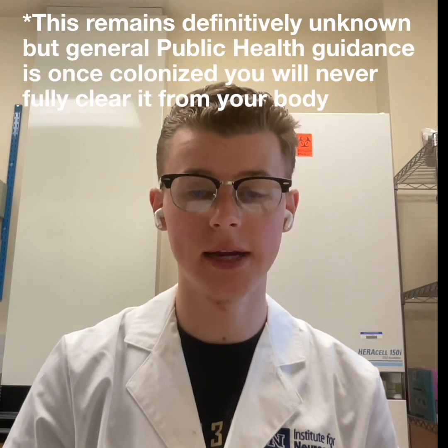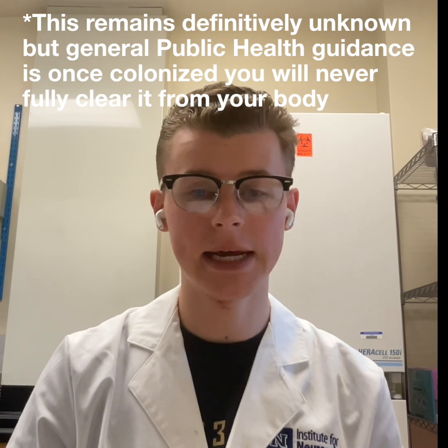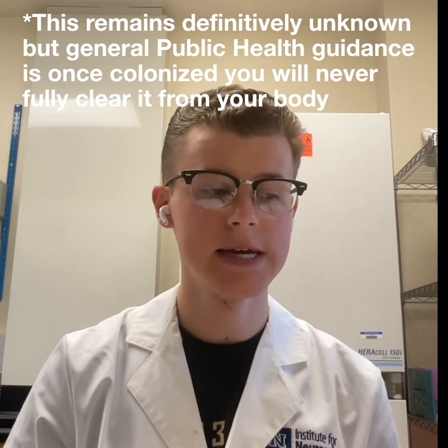Now, as you may know, Candida auris is a bit more nefarious than its other Candida species counterparts like Candida albicans. It is worked with under enhanced BSL-2 precautions, and during infection, it kills about 30 to 70% of people. Some people are colonized for life, and so it is a very tricky pathogen. It colonizes surfaces super easily.